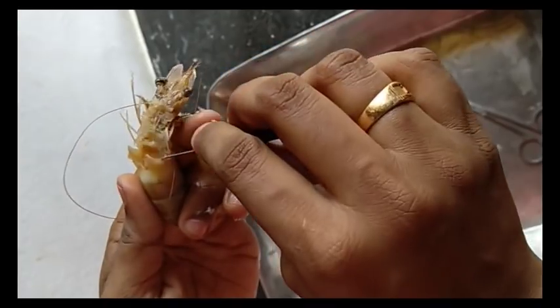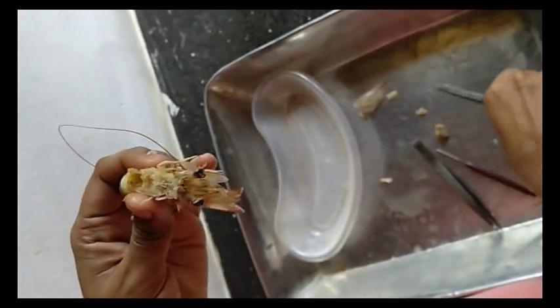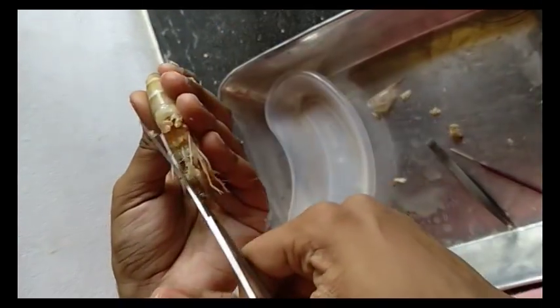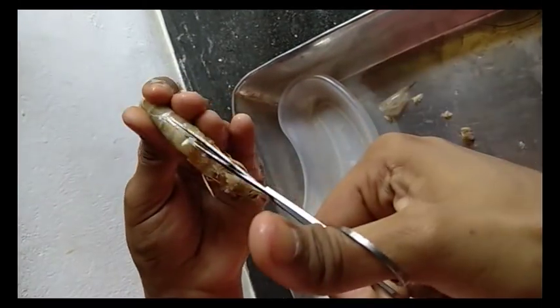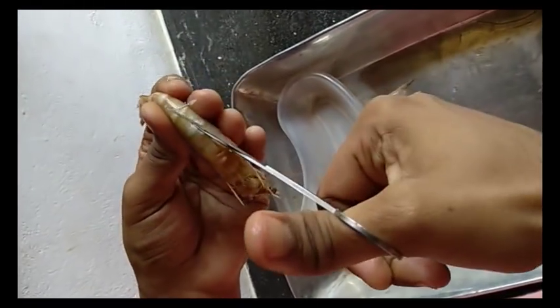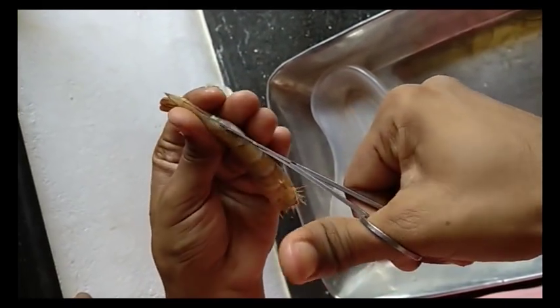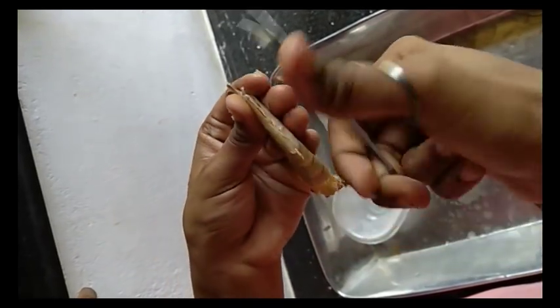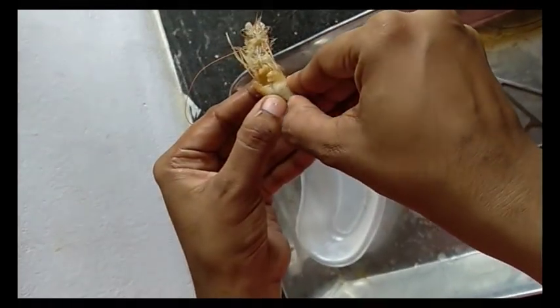Okay, now going downwards, we have to make a cut mid-dorsally, cutting the abdominal part through the tergum. Make a cut till the telson area. Made a cut. Now we are going to open it.